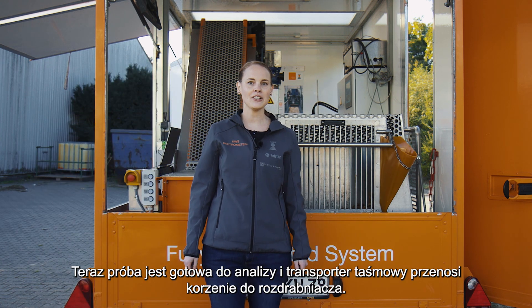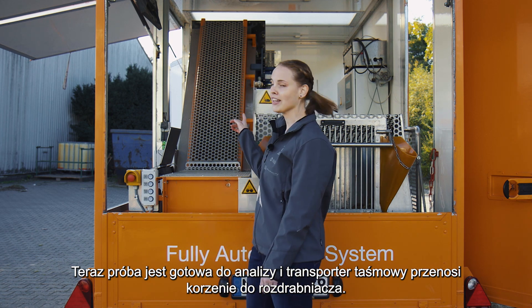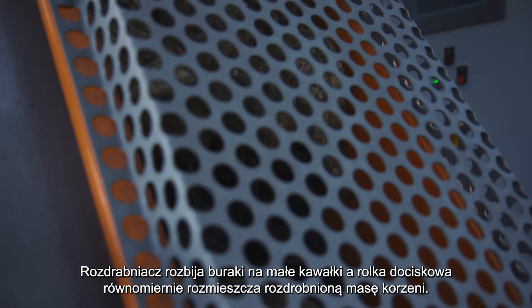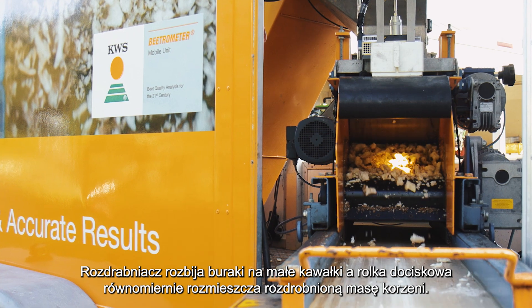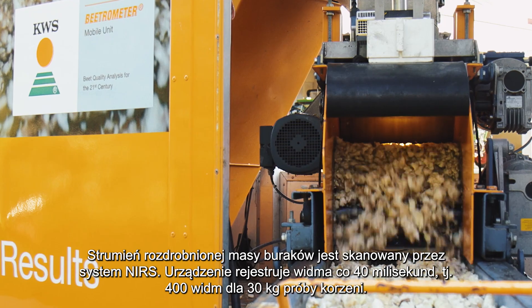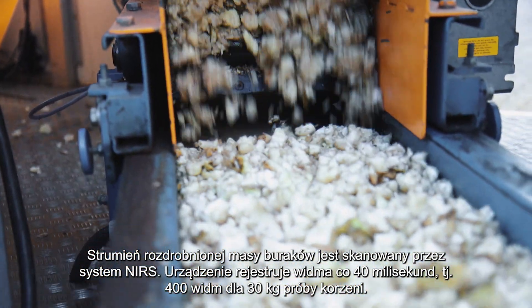Now the sample is ready to be analyzed. After we start the process, the beets will be transferred via the conveyor belt into the chopper. The chopper crumbles the beets into small pieces, and afterwards a pressure roll creates a uniform stream of beets. This stream of beets is scanned by the NIRS system, which records a spectrum every 40 milliseconds — around 400 spectra for a sample of 30 kg.